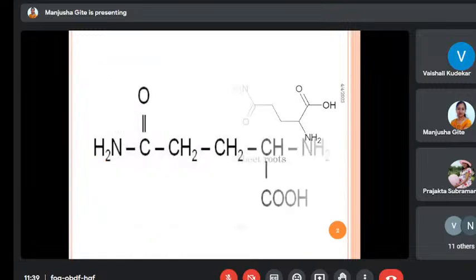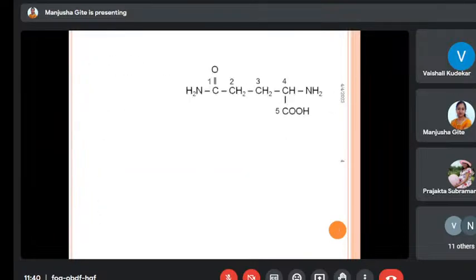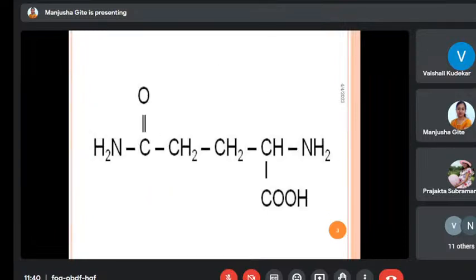In whatever structure I have determined, there is an NH2 group, a primary amino group. There is a doublet in this range, so the given compound may be confirmed. Same thing, the C=O group is there. Also observe carefully the acid; the last group is acid.